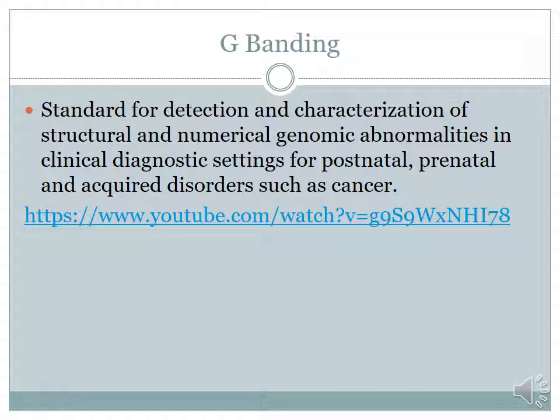G-banding is the standard for detection and characterization of structural and numerical genomic abnormalities in clinical diagnostic settings for postnatal, prenatal, and acquired disorders such as cancer. Please visit this YouTube video to see G-banding.